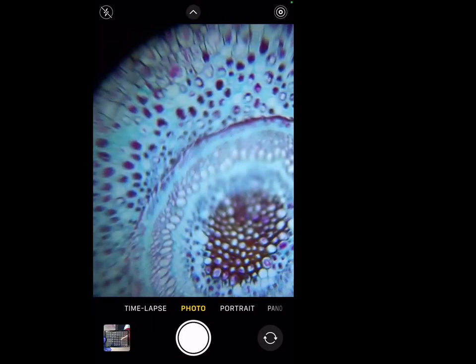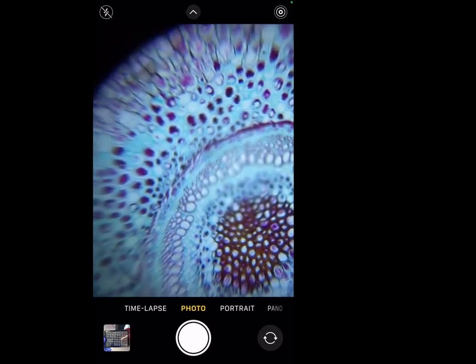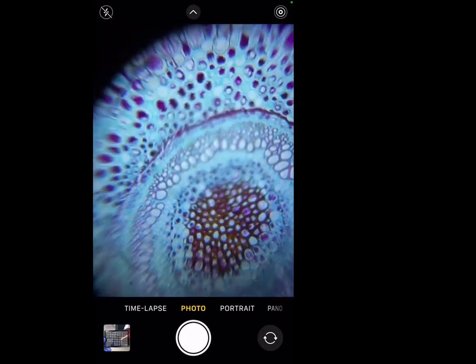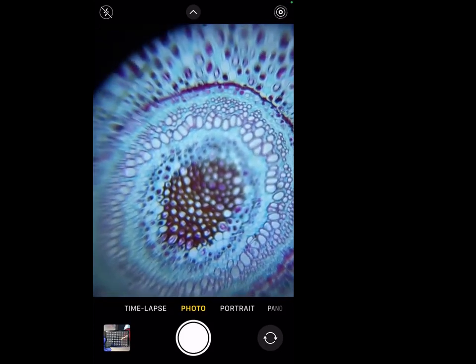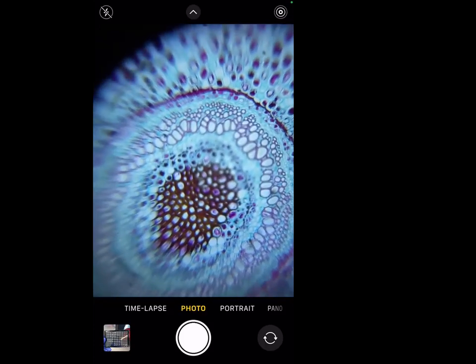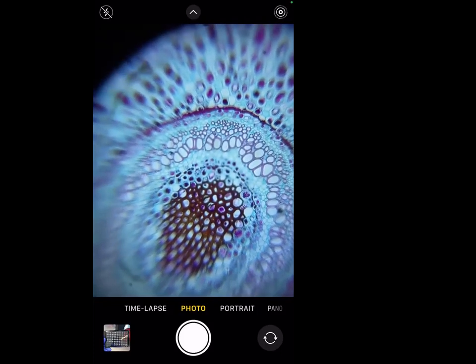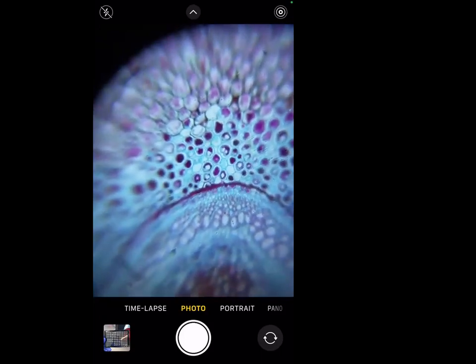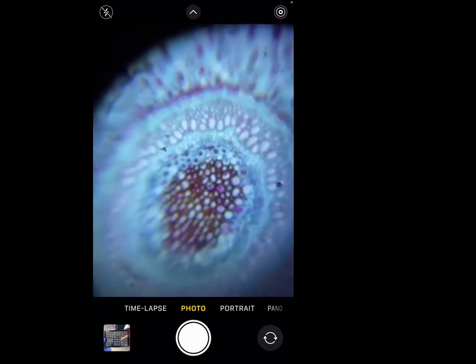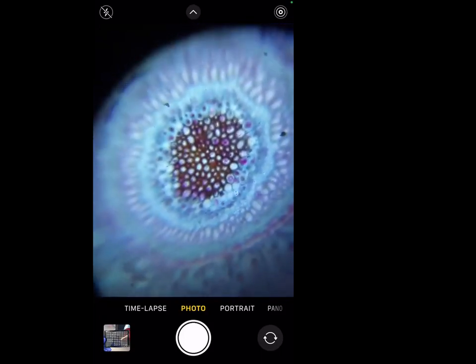As I'm moving the wedge, I'm also moving the sample a little bit. So this is where, you know, it's a frugal machine. It's not super precise in terms of movements, but if you are patient, you should be able to visualize this. And you guys probably have better cell phone cameras than I have. And yeah, there you go. Your positioning is nice.